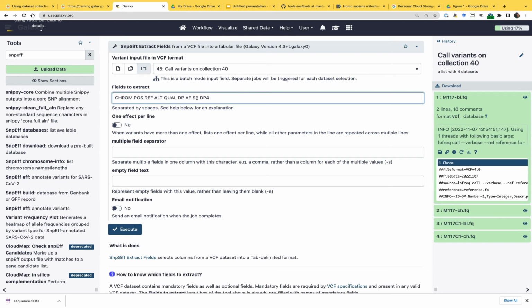If you don't want to do this, it's basically chromosome. Well, we only have one chromosome in this because we mapped against mitochondria. So chromosome, in other words, is which sequence we mapped against. We mapped against one sequence. Then it's going to be the position, so where our variant is. What's the reference allele?